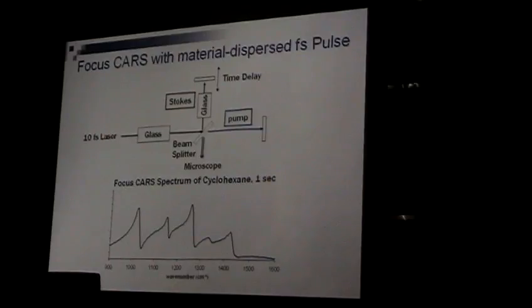I just put it in. Because of this dispersion issue, the blue part is always stretched less, so you have to stretch the red part more, and basically compress with another small piece of glass to make these two well-balanced dispersed parts. Then I just combine them using this simple micro-interferometer type setup, discarding half of the power, and just do microscopy.